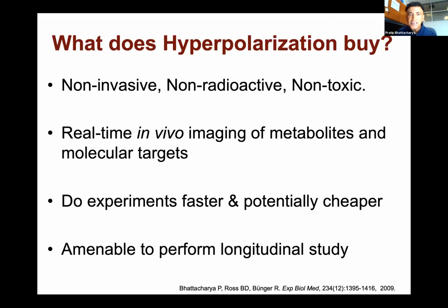So with that hyperpolarization, we now have the ability to do experiments really fast and cheaper, do longitudinal studies, and do real-time metabolic imaging. I think it's almost self-evident, but I want to show you this just for the point of completion. Next slide, please.